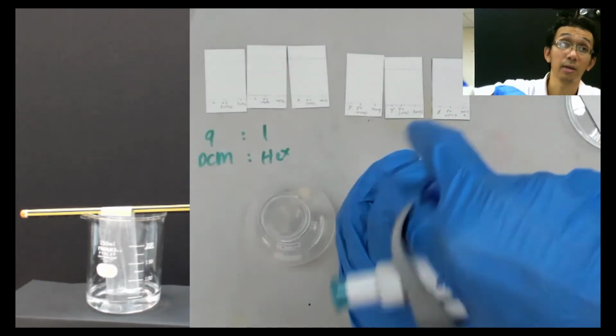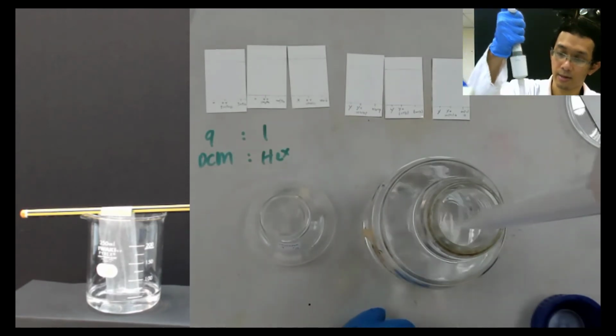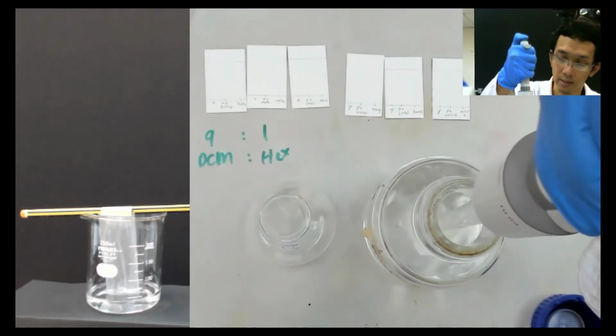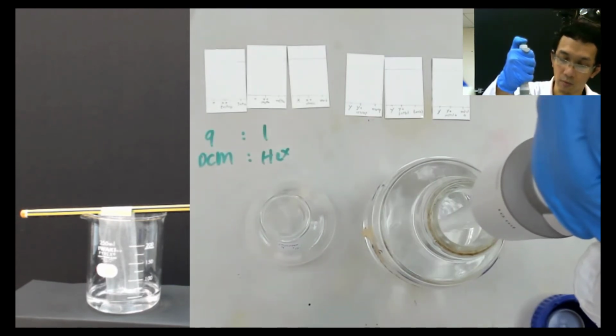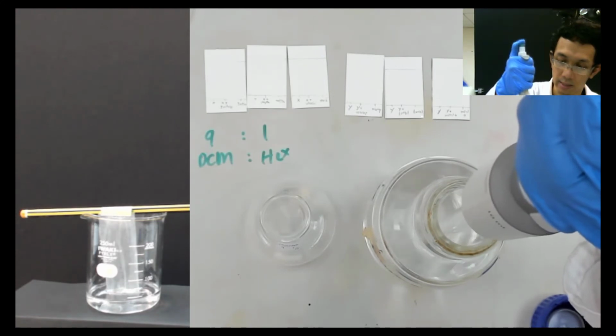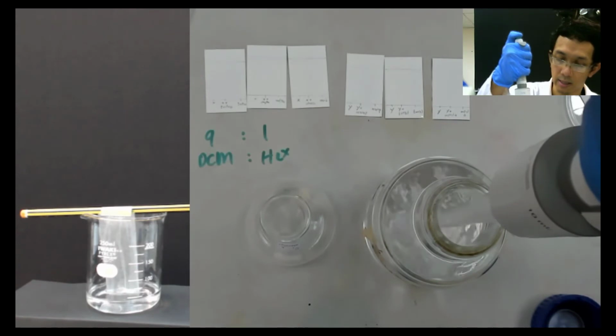We open it and we take 9 parts of that. When you use a pipette, please make sure that when you want to suck up the liquid, you hold it very perpendicular. And then we start, and you see again.